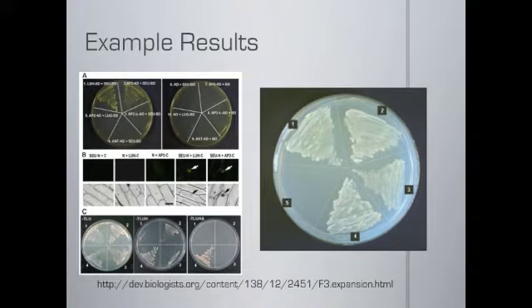Also, you can see on the left side similar things with some of these plates. That's just to make sure that we're eliminating all false positives and making sure that these proteins that we sequence, that we find out interact with our bait, with our HspB2, are in fact dependent on HspB2.